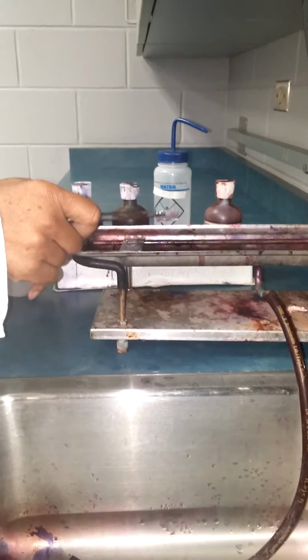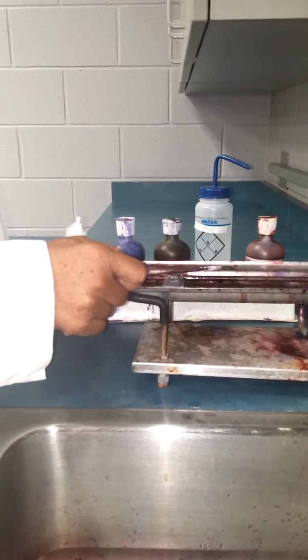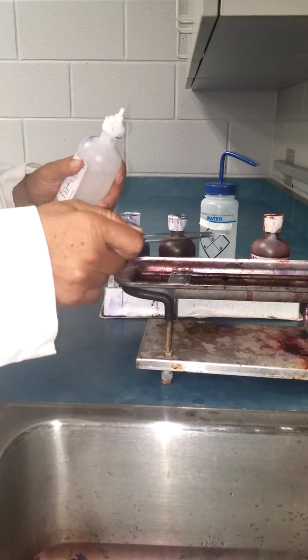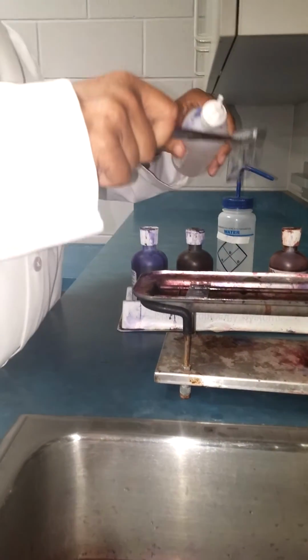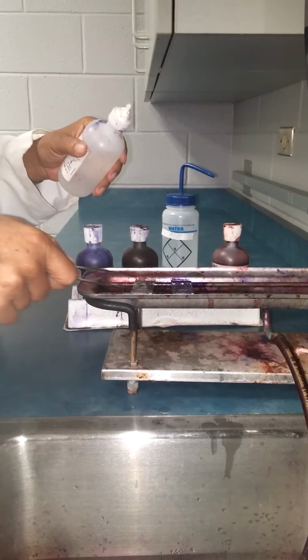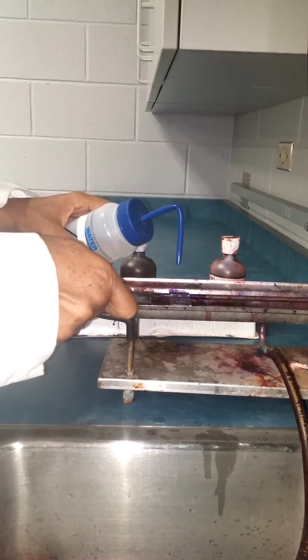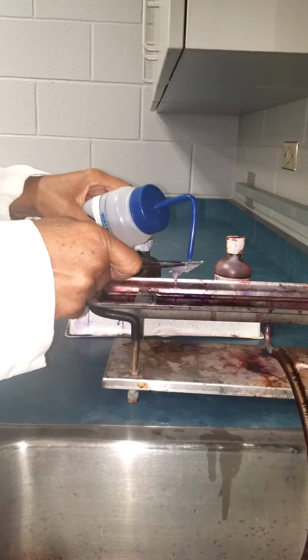And whether the crystal violet is retained or lost is dependent upon the type of cell wall, the outer covering of the bacterium. So the decolorizer goes on for 2 to 5 seconds, and then it's rinsed off.